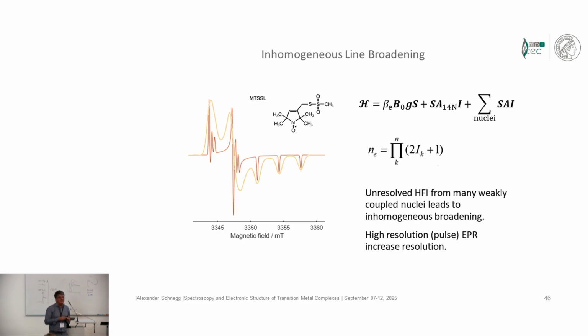Up to now, we were dealing with interactions which were pretty well resolved in the spectrum, or where we even had problems to make our spectroscopic window broad enough to really cover the interactions, like in the case of these immense hyperfines which I have shown, or a more frequently encountered case, large zero field splittings. This makes our transition energies large. We need large fields and large frequencies. However, a lot of information is also contained in small interactions, and this is in particular the hyperfine interactions, the quadrupole interactions, and the electron-electron dipole interactions.